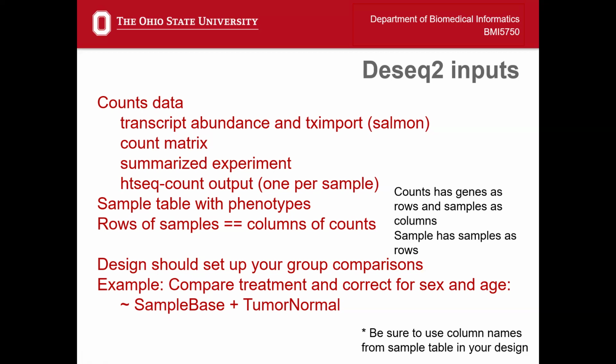So in our example, we're just comparing a group of tumor samples with a group of normal samples. But if you know anything about how cancer is studied, this normal sample is coming from the same person that the tumor came from. So this is called a paired analysis, because you have a tumor from your patient and a normal measure from your patient.